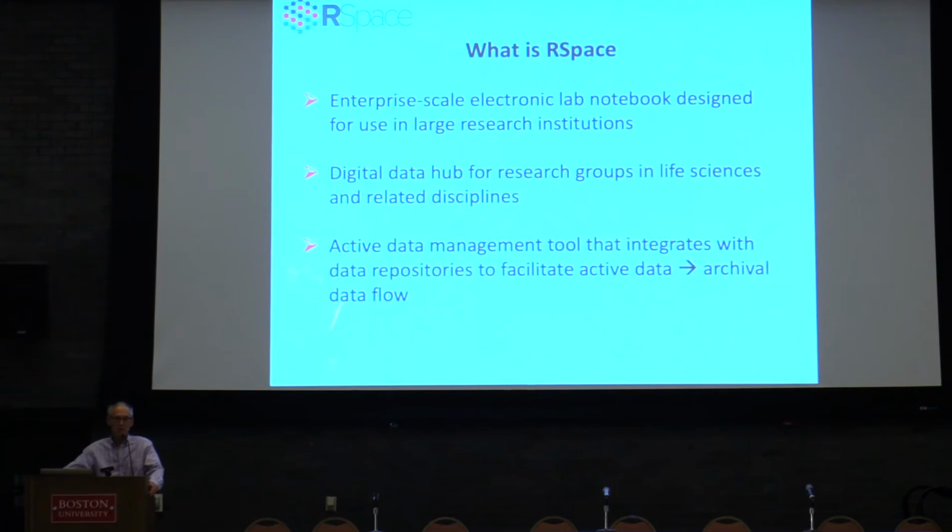So today I'm going to talk about RSpace. So what is RSpace? And I realized, like Dataverse, it's not a computational product. So this is slightly different from many of the other talks and for this audience. So what is RSpace? It's an enterprise-scale electronic lab notebook that's designed for use in large research institutions like big universities. What does that mean exactly?